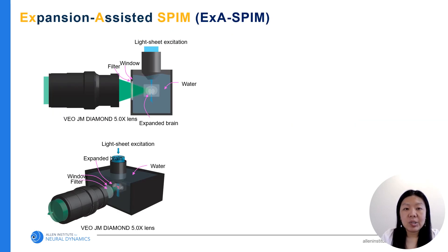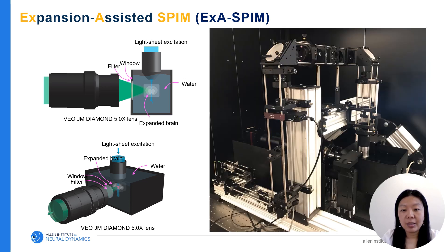This is the system layout. The illumination light is coming from the top and this large lens collects the signal from the side. Here is the picture of the portal lab located in our lab.